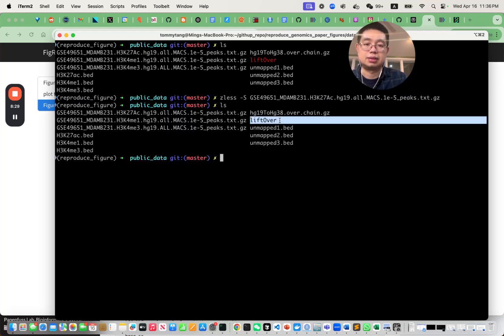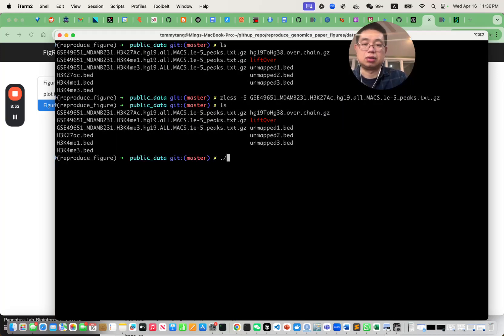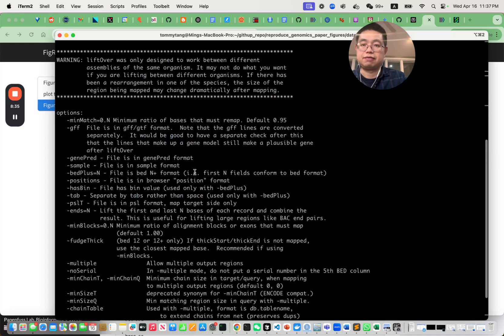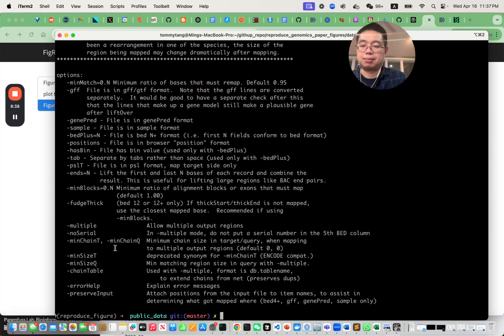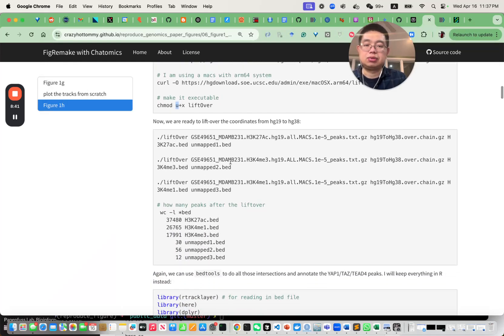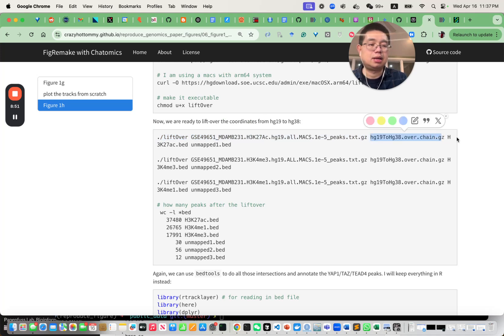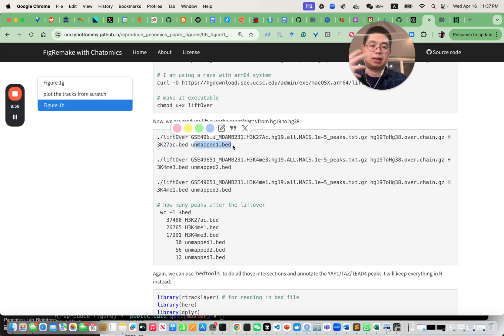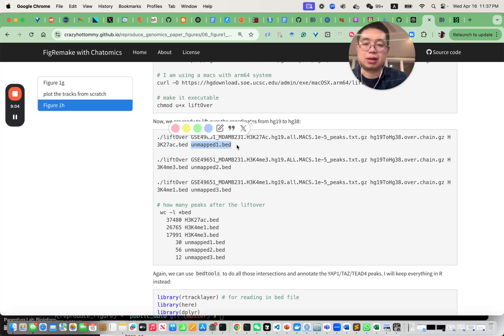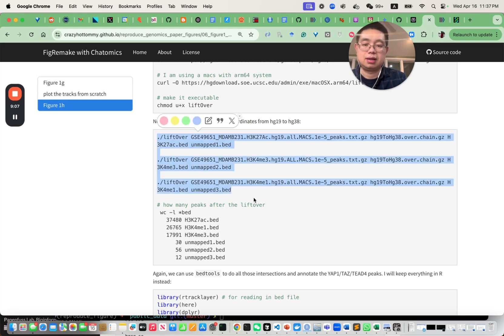The LiftOver command is straightforward: you provide the input BED file, then the chain file, then the output file — for example, H3K27 acetylation output — and then an unmapped file, because some regions are not mappable between the two genome versions. You do this for all three files.